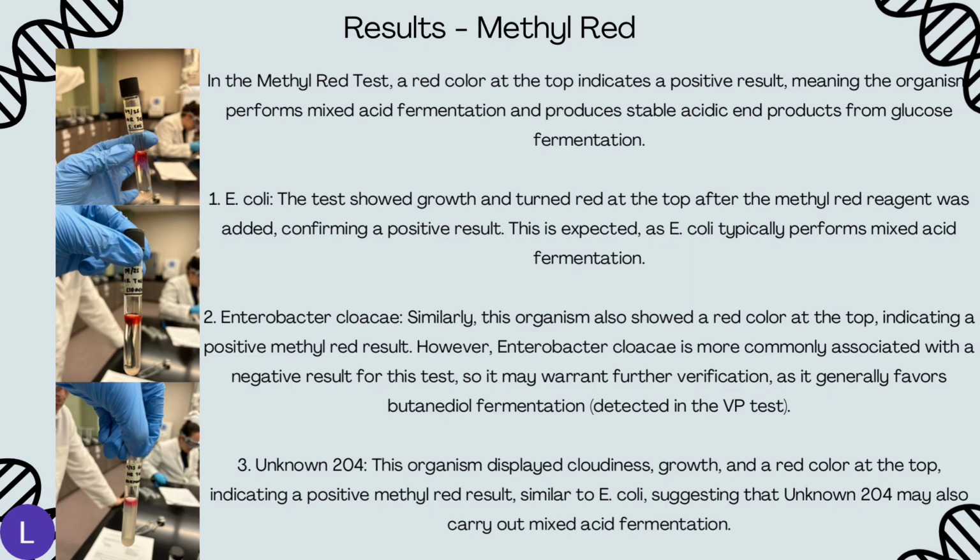Lastly, for unknown 204, this organism displayed cloudy growth and a red color at the top, indicating a positive methyl red result, similarly to E. coli, suggesting that 204 may also carry out mixed acid fermentation.